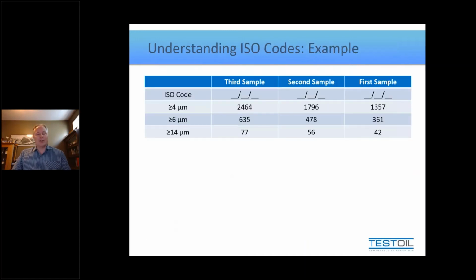Look at these 3 particle counts. Now notice how they're labeled first, second, and third sample. As the trend goes from the first to the second to the third sample, what would you say is happening to the particle count? Well, you'd probably notice that it's increasing. Now if I asked you, is it increasing a little bit or is it increasing substantially? That becomes a subjective answer. Right? Some of you may say, no, it's not really that much. And other people go, wow, it's almost doubling. That seems substantial to me. So how can we all agree whether or not that particle count is increasing substantially or just a little bit? Well, that was the purpose behind the ISO coding system.